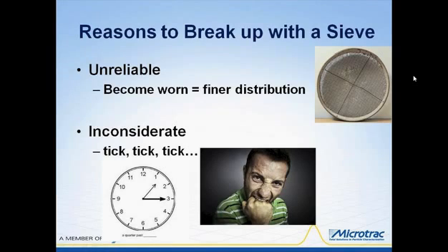And it's a time consumer. The sieve analysis requires anywhere from 15 to 30 minutes to complete, not including results calculation. Considerably longer than computer automated size analysis.